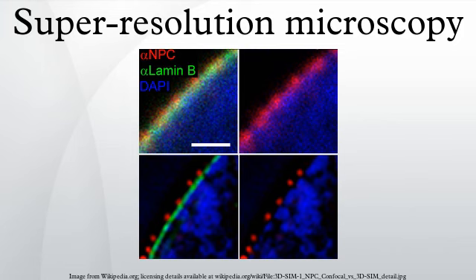The spot width is equivalent to the point spread function and is defined by the microscope resolution. Lateral coordinates of the given particle can be evaluated with a precision much higher than the resolution of the microscope. By collecting the information from many frames, one can map out the near-field intensity distribution across the whole field of view of the microscope.